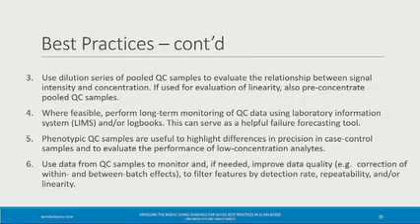And the reporting side of things, we've seen a lot of issues in the literature. So mQACC did a scoping review of 2021 literature, and we encountered exactly what you're talking about. It was really hard to tell from a paper what people did. Five expert metabolomics people read the paper, and sometimes we disagreed on how we interpreted what was said. Did they do it pre-extraction? Did they do post-extraction? How frequently did they do their injection? So it was very difficult from the current literature.